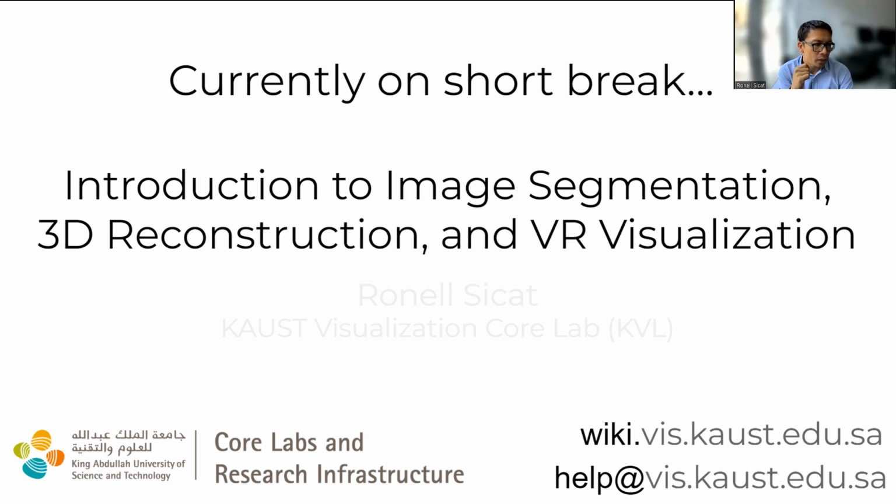Because the other thing that I wanted to mention is that the TechViz application that I showed earlier also needs a separate license, and those licenses are installed only in the KVL's VR facilities. So if you want to be able to use Avizo directly in VR, you would have to go to KVL's VR facilities to do that.